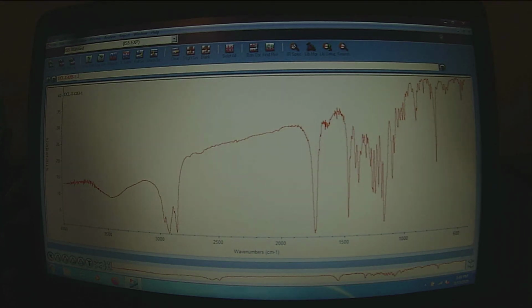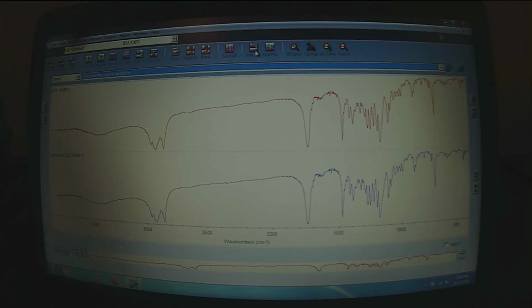And you recall that the baseline was kind of sloped. High energy side on the left, there was a lot more light scattering, and so we didn't get a clean baseline. We kind of got this sloping baseline. One of the first things we're going to want to do is to set that baseline so that it's more flat. And there's a button in the top section where there are two here, which if I hover over it will tell you that's baseline correct. And I can click on that and it'll open a window, the baseline correct window.